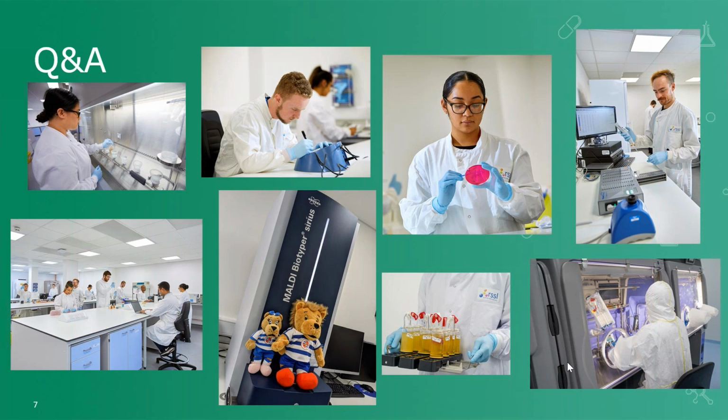Excellent. So a question from Ammon is, how big a problem are mycoplasmas? Quite a big problem. Mycoplasmas are strange. You can go some time without a mycoplasma problem, then get a mycoplasma problem and find it near impossible to get rid of. Sometimes getting rid of it can result in the loss of an entire cell line, for example, and then result in starting from scratch. It does vary, but it is always going to be a constant problem.